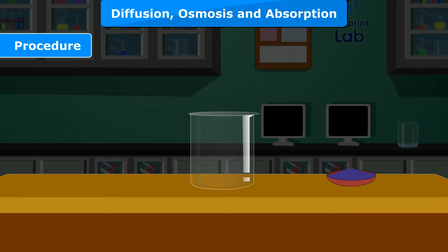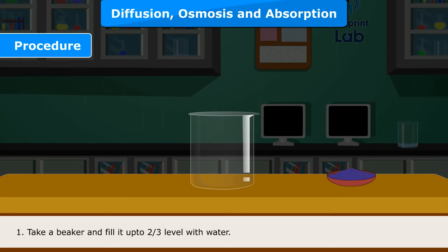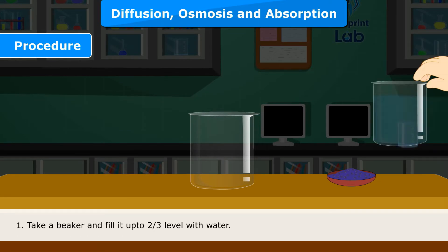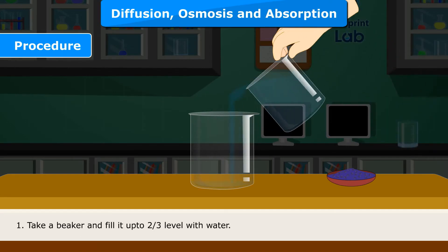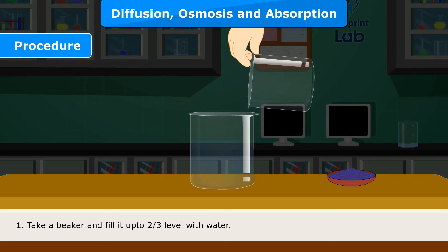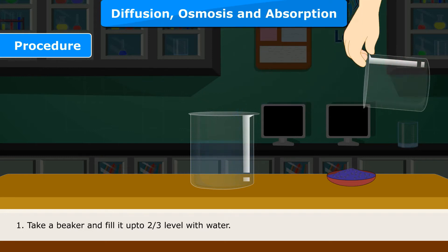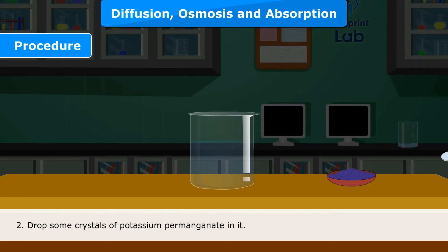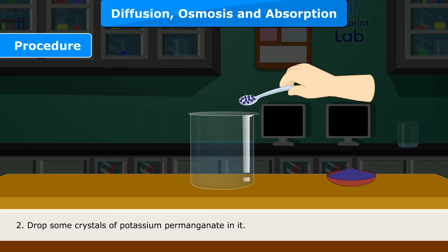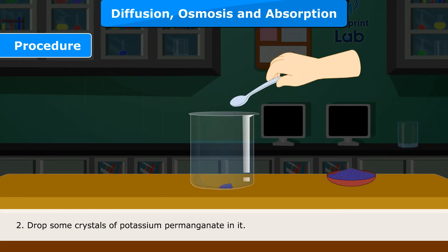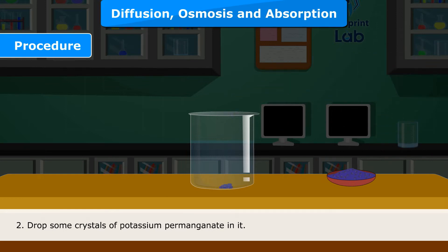Procedure: 1. Take a beaker and fill it up to two-third level with water. 2. Drop some crystals of potassium permanganate in it. 3. Keep the beaker undisturbed and observe.